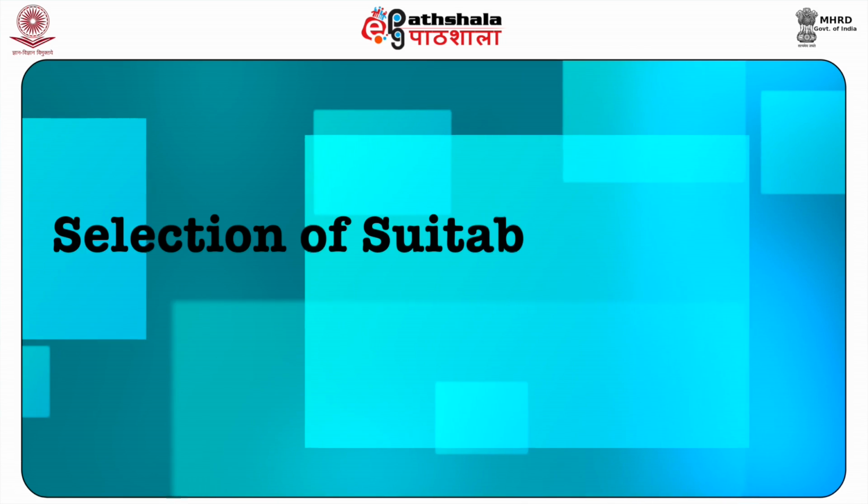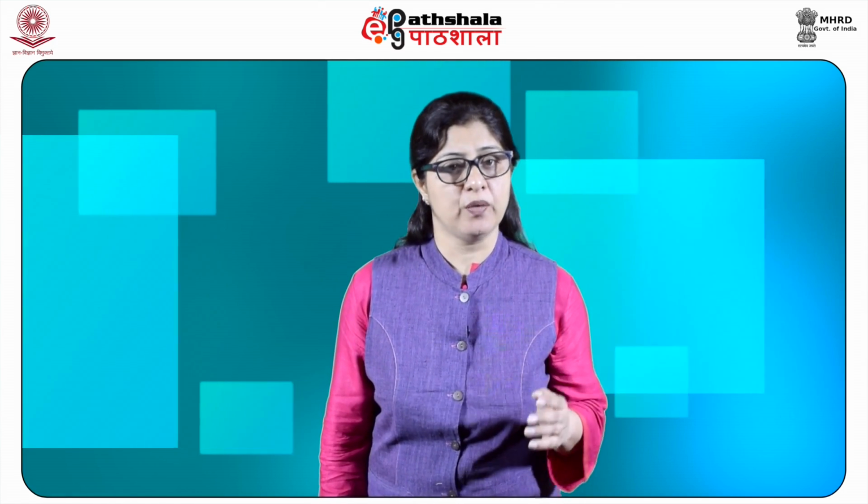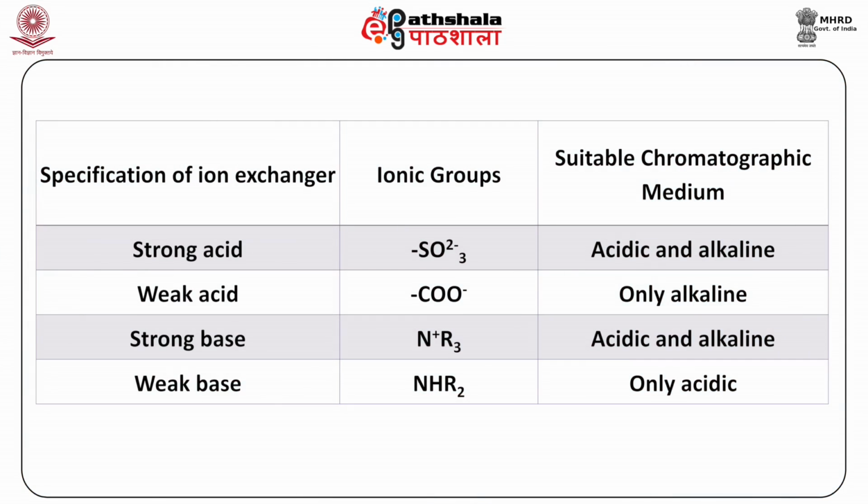Selection of suitable systems. It is useful to classify ion exchangers according to the pK value of their ion groups. However, the given table shows the simplified survey of the working ranges. For example, for a strong acid, the ionic groups are sulfonic and they are suitable for the acidic and the alkaline chromatographic medium.